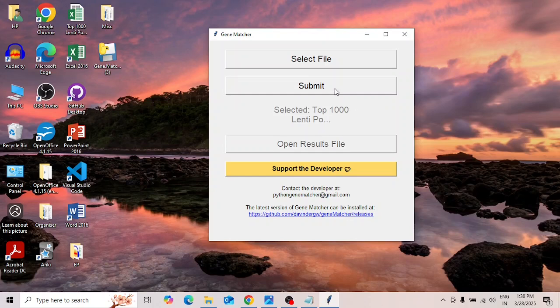Then you have to submit, and when you click Submit, the program will analyze the data. Once you've clicked Submit, you can click Open Results File to view the results of the analysis. You can also see what file has been selected. So this is the file that will get analyzed when you press Submit.